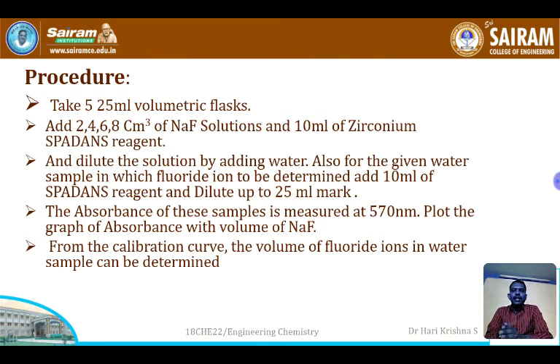So all the given fluoride, we are going to dilute it up to the mark using water. So now we are going to measure the absorbance of these samples at 570 nanometer.